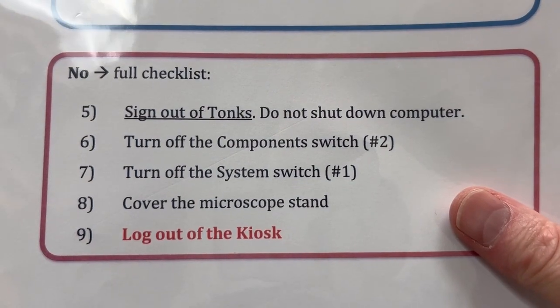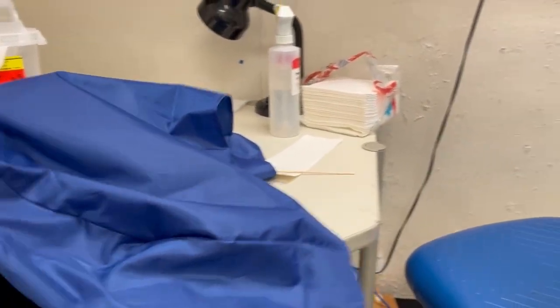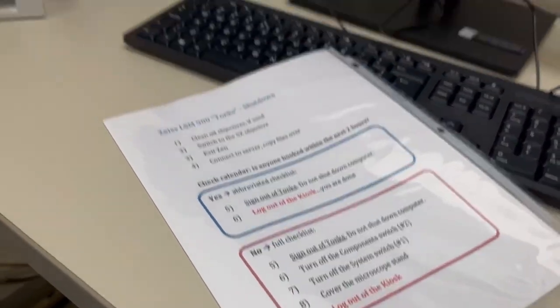Finally, we're going to cover the microscope stand and log out of the iLab kiosk. I'm just going to put the dust cover on. And then once that's complete, we will log out of the kiosk.